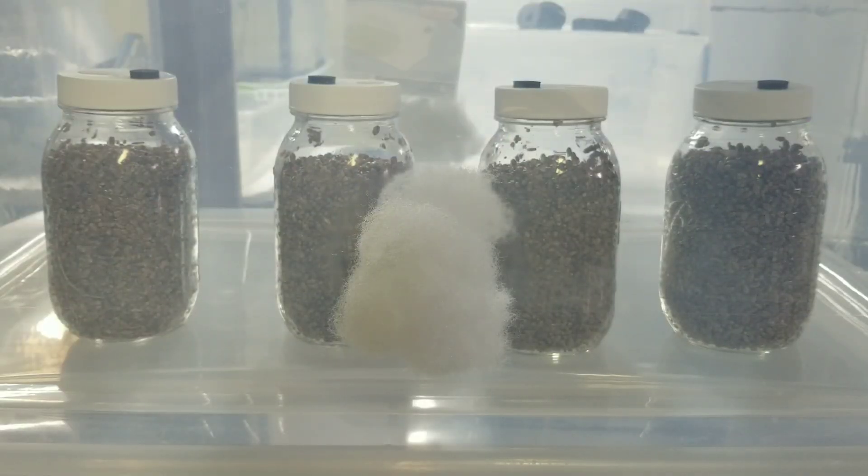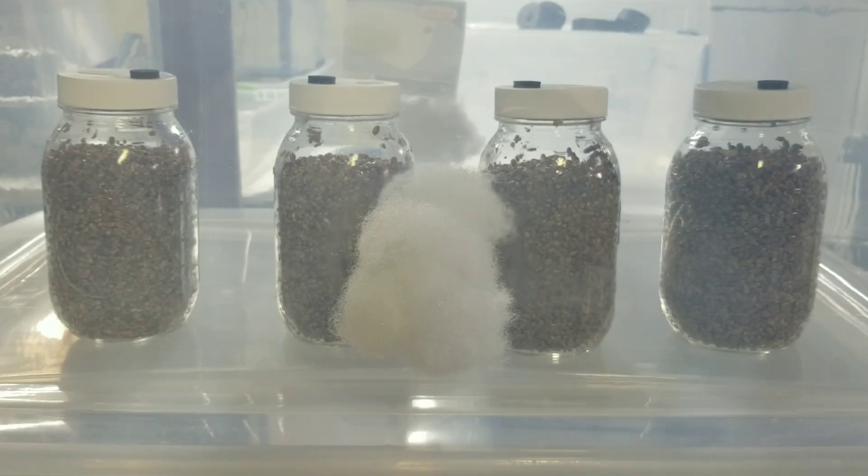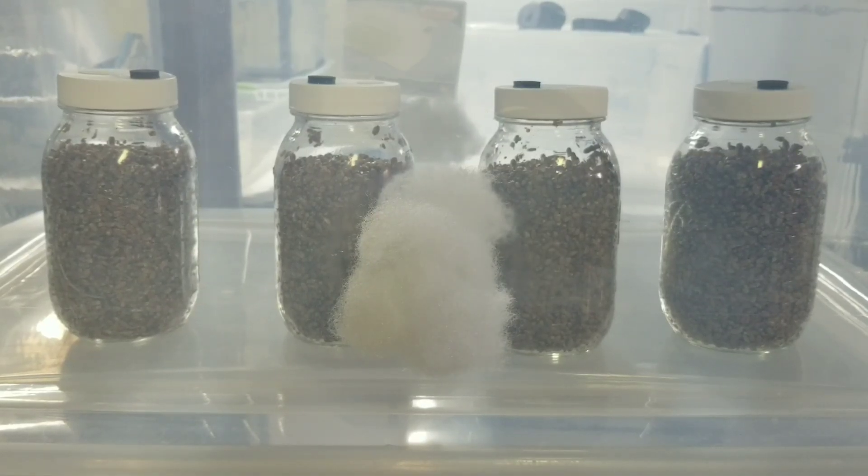All four jars are in the storage tote. I incubate all my jars in these 105-quart clear Sterilite storage totes. I have holes drilled in the sides - anywhere from one and a half to two inch holes - stuffed with balls of polyfill. The polyfill allows a little air exchange into the tote but keeps airflow to a minimum. You might run into trouble having jars in open air because it's a high airflow environment and that can lead to increased rates of contamination.